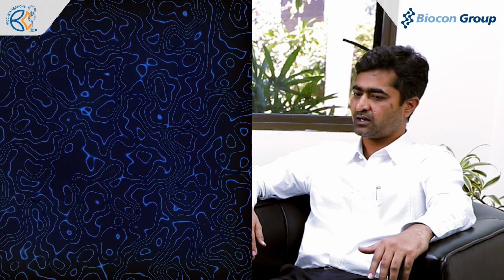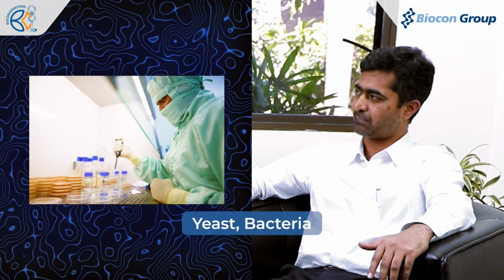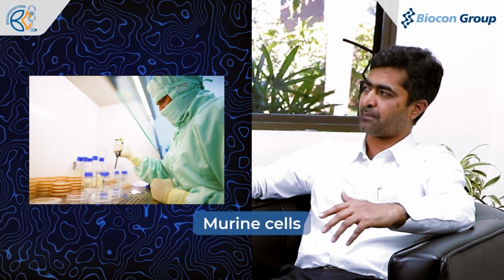So what are the types of cells that you typically work with in your development? Okay. So it depends on the biosimilar medicine we are making and the complexity of the cellular machinery that needs to make this drug. Generally, we have been employing microbial systems such as yeast and bacteria, and also mammalian systems such as hamster cell lines and murine cell lines.